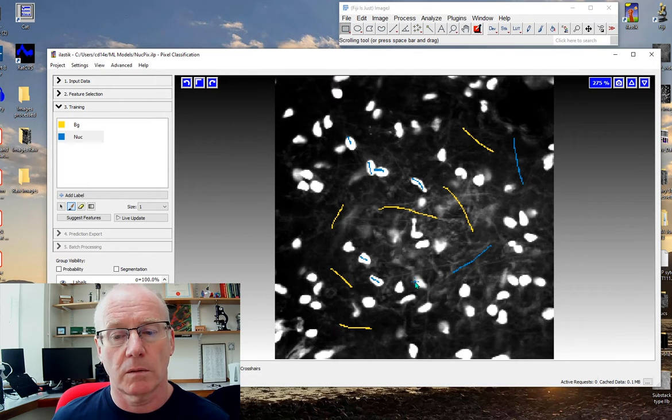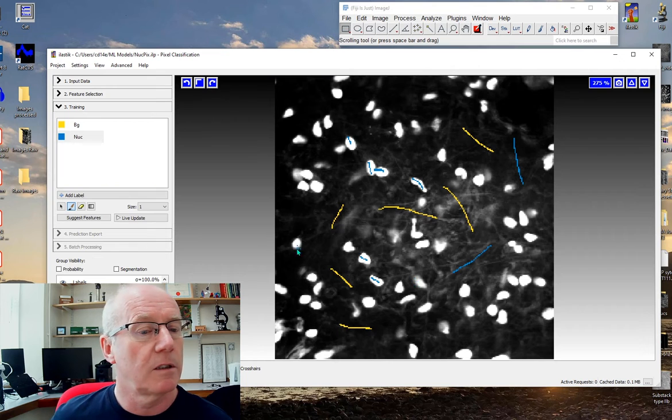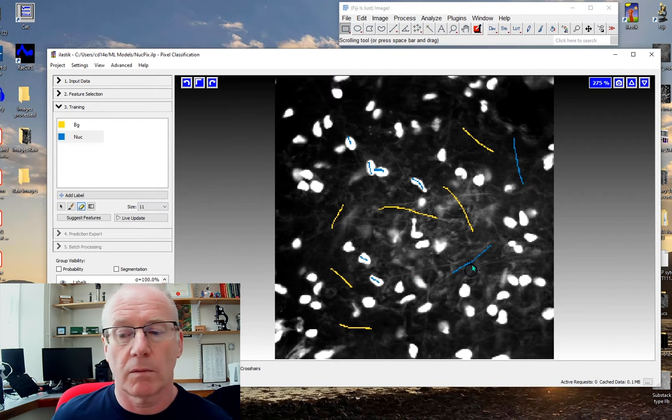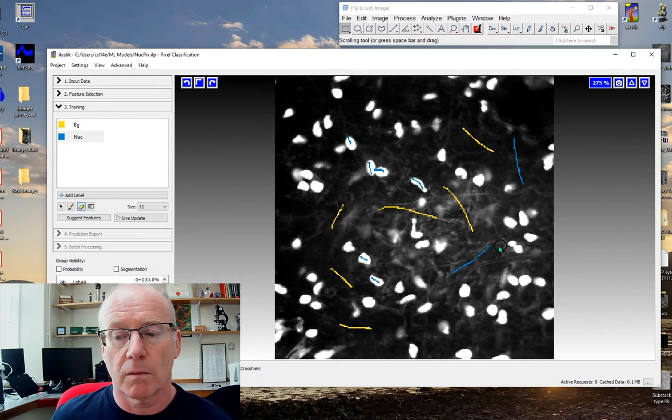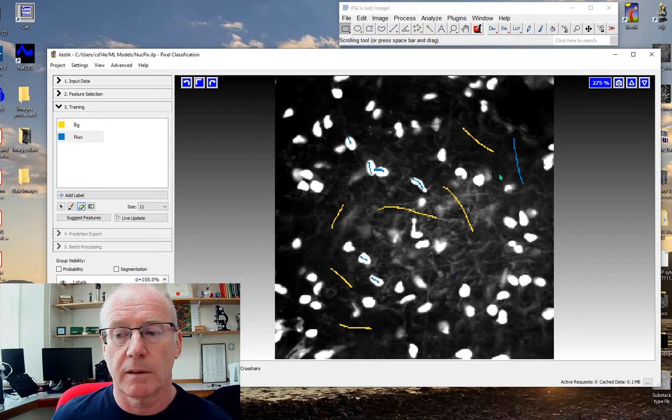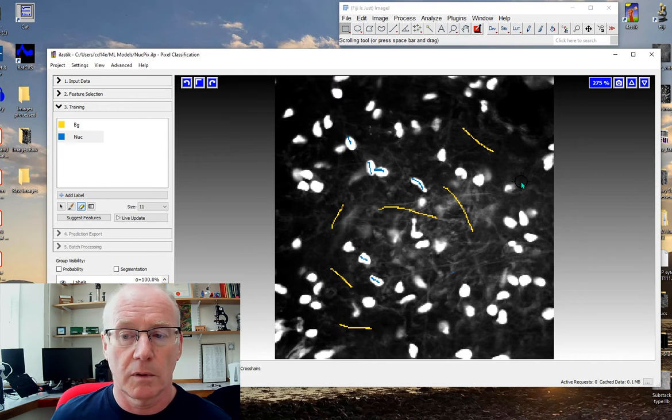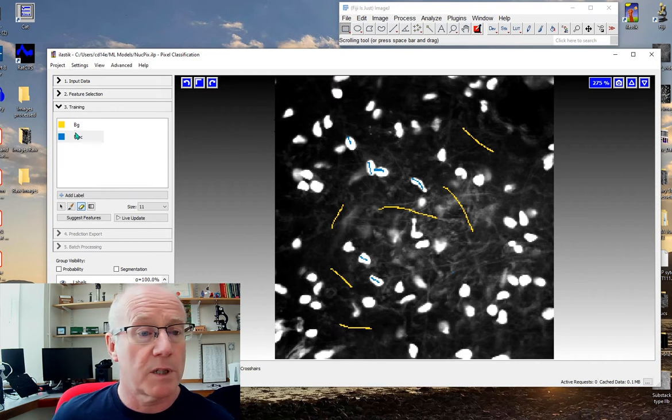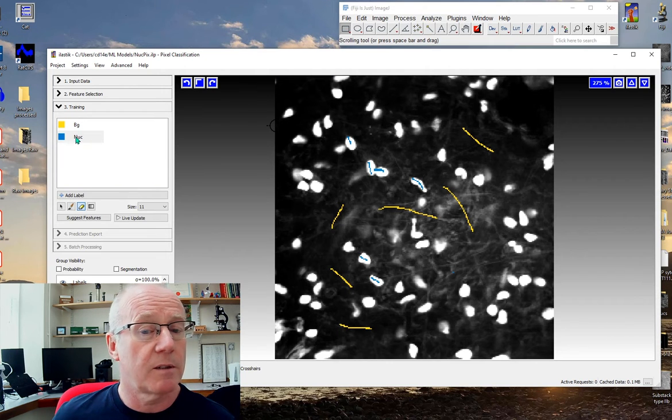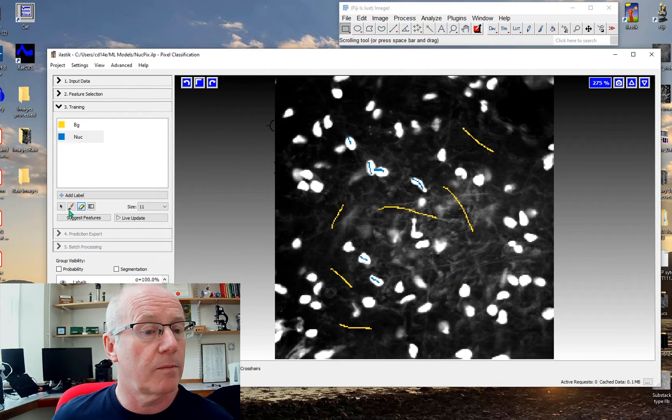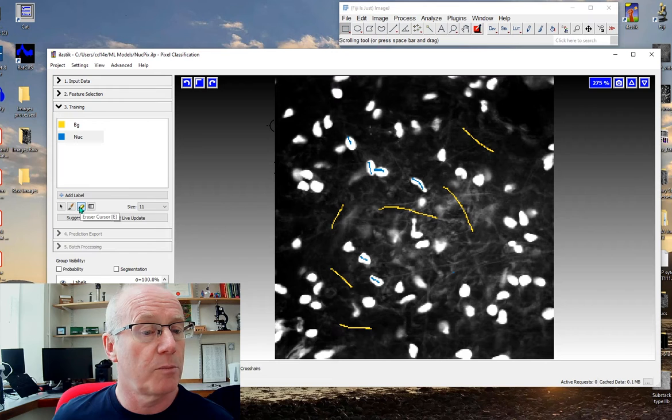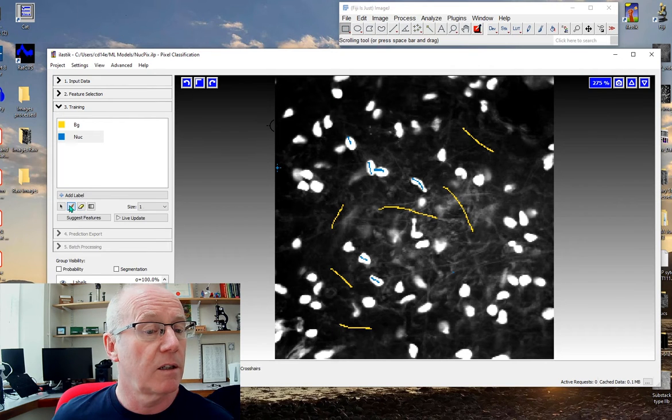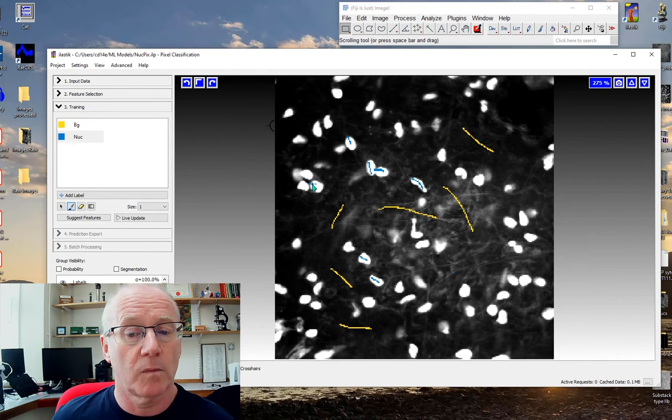Oh, I've done that wrong. Let me just rub out that label. It's quite useful to make a mistake so that it reminds me to show you how to change from the eraser to a paintbrush.